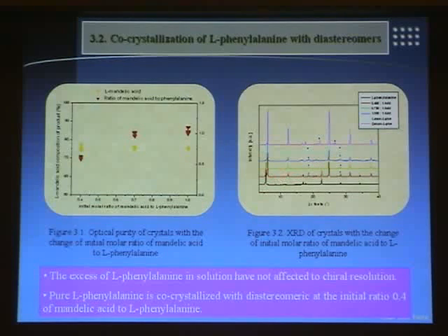However, at sample 0.4, we can see they have the characteristic of L-phenylalanine, L-mandelic acid, but they also have the characteristic peak of L-phenylalanine here and here.